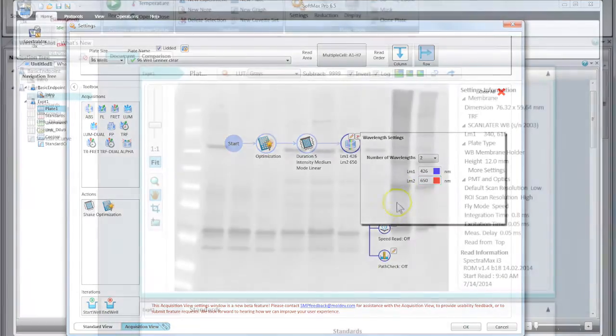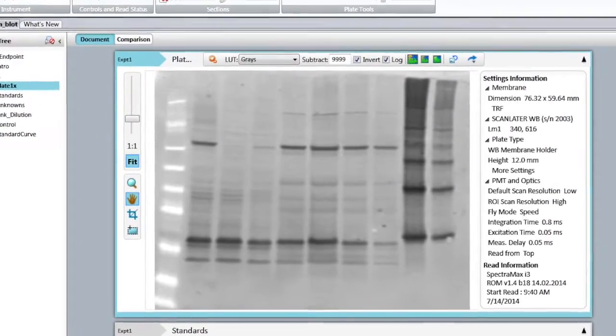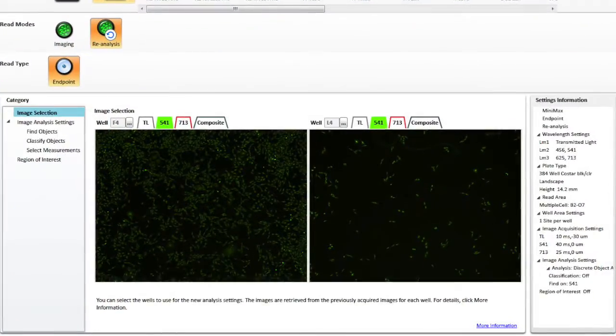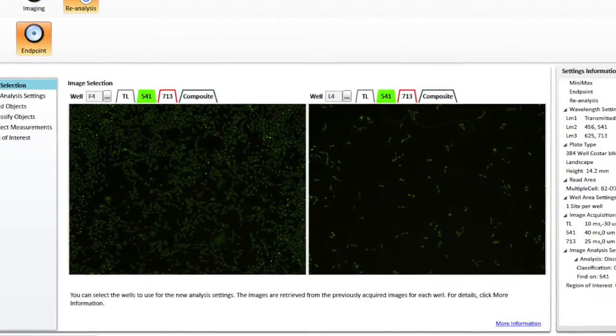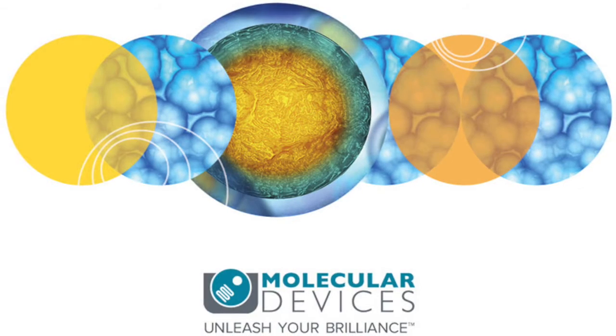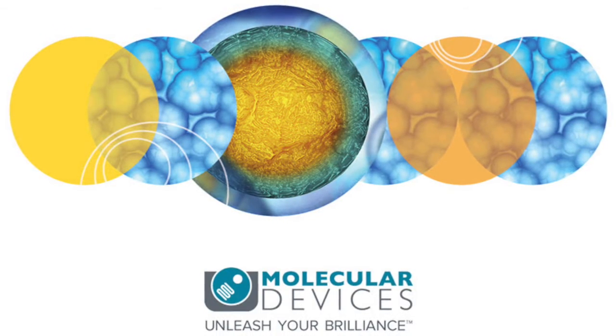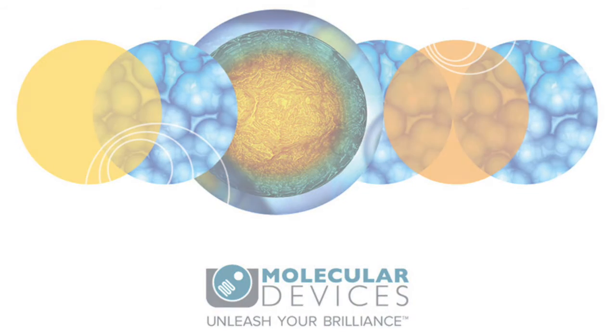To use the Scan Later Western Blot Detection cartridge for a Western blot membrane read, or to acquire cell images with the Minimax imaging cytometer, please continue to use the standard view. These changes are paving the way to include exciting new read mode features for a future version of SoftMax Pro. With changes like this, we need your feedback to make the new Acquisition View settings window intuitive, fast, and a feature that you enjoy using.